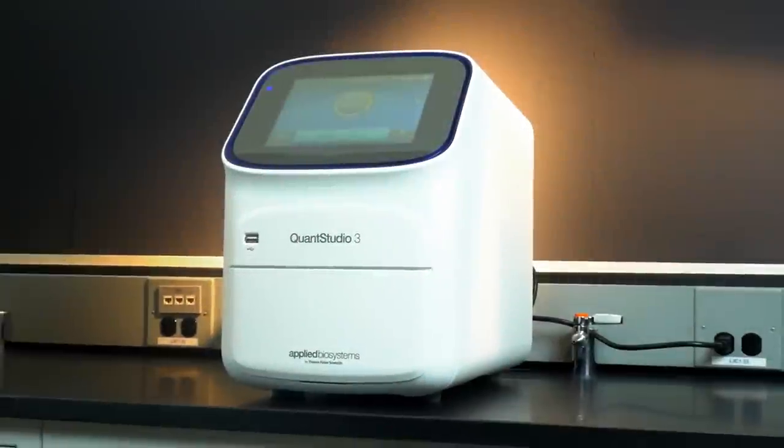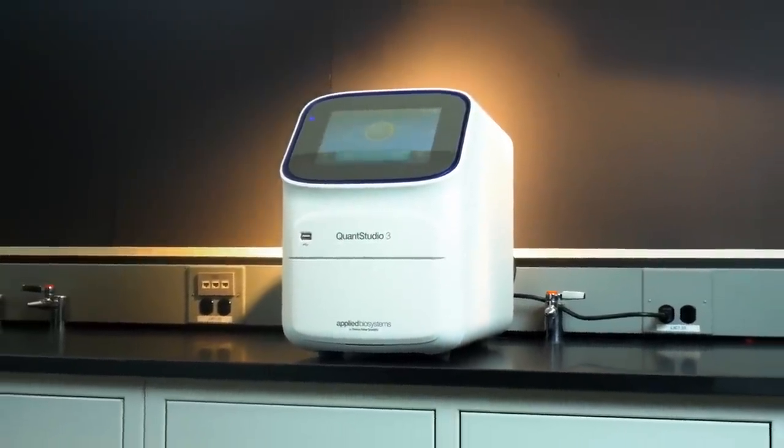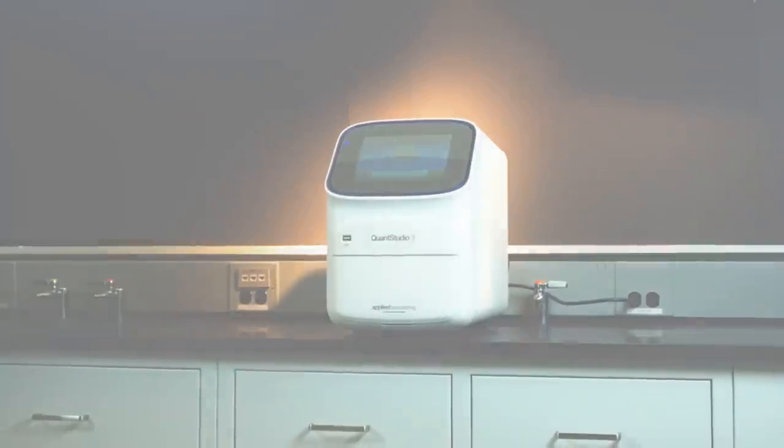Introducing the Applied Biosystems QuantStudio 3 and QuantStudio 5 real-time PCR systems.